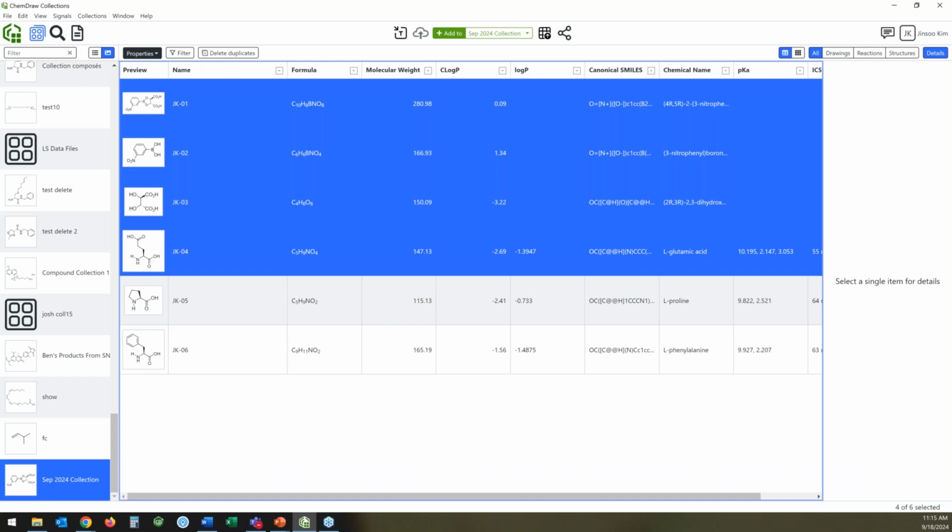So with that, I think that's all I'm going to share about collections. So I'm going to hand it off to Lindsay at this point to get into the ChemDraw Plus application.